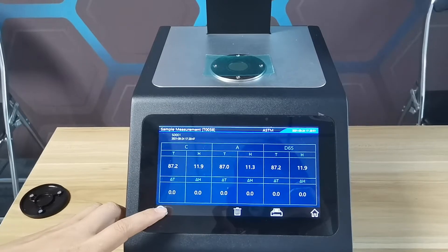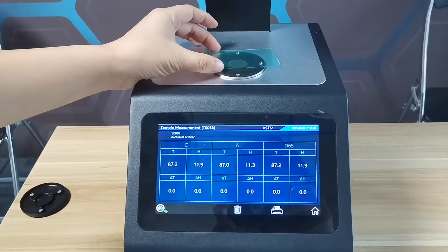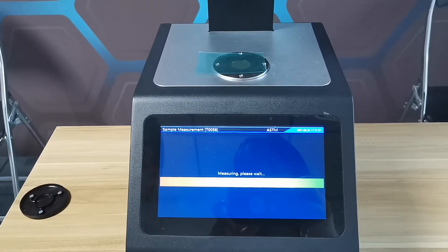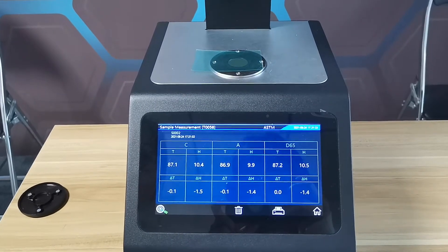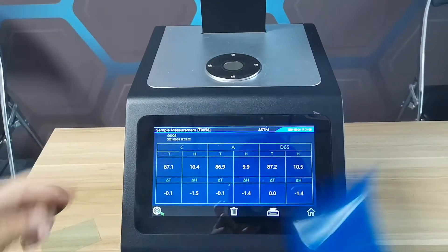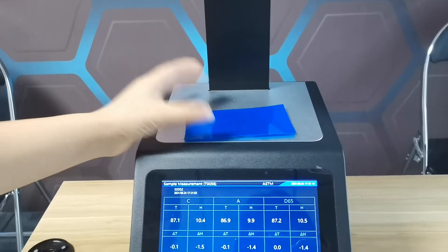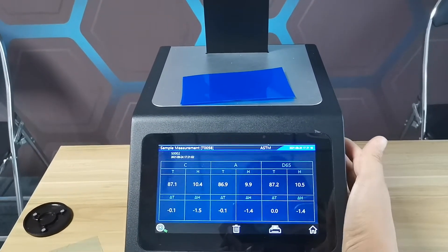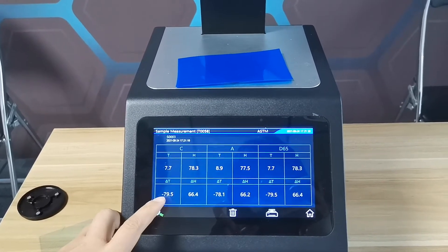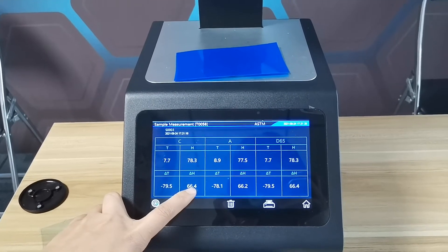Repeatability is very good. Change to another point. Test another product. The transmittance difference is bigger. The haze difference is bigger, too.